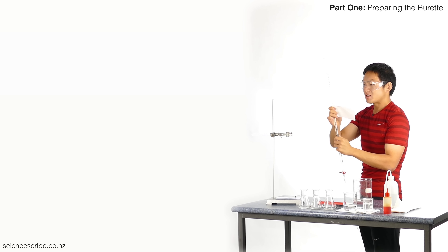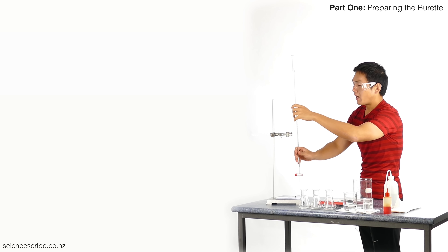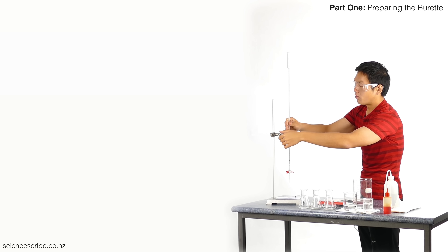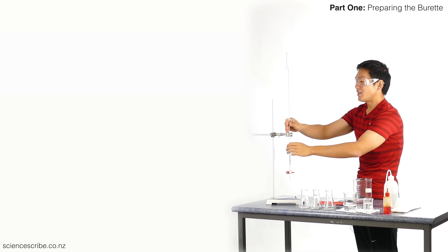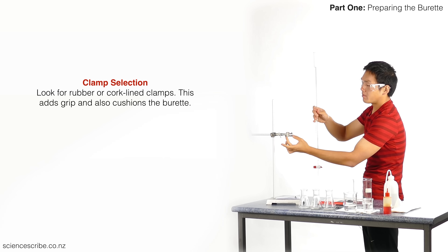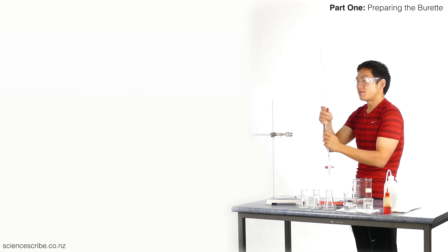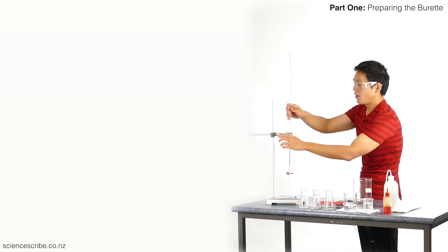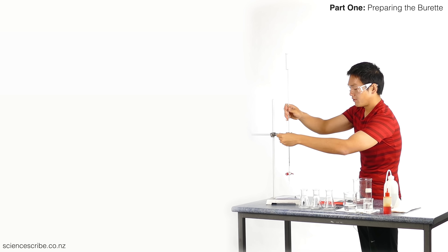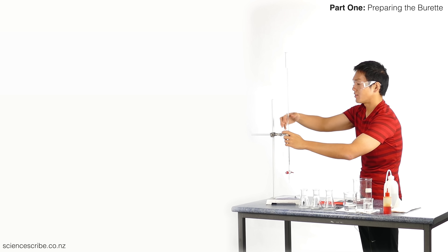Just to make sure everything's nice and dry, I'm going to use my paper towel and give the outside a cautionary wipe down. I can feel it's dry, but I'm just giving it a cautionary wipe. I'm going to clamp up my burette now. If you're at a well-equipped school you might have a burette clamp — those plastic banana-shaped things that snugly clamp the burette in two places. In my case I've just got a basic clamp, and I make sure the inside is rubber or cork for extra grip and cushioning. Carefully close that clamp — if it's too tight the burette will shatter, if it's too loose it will fall through.